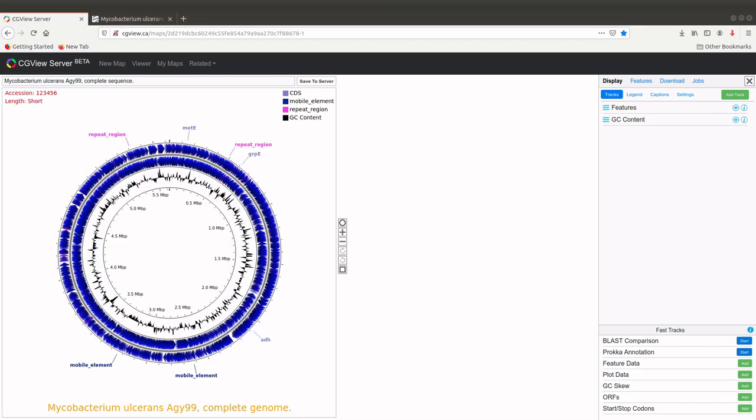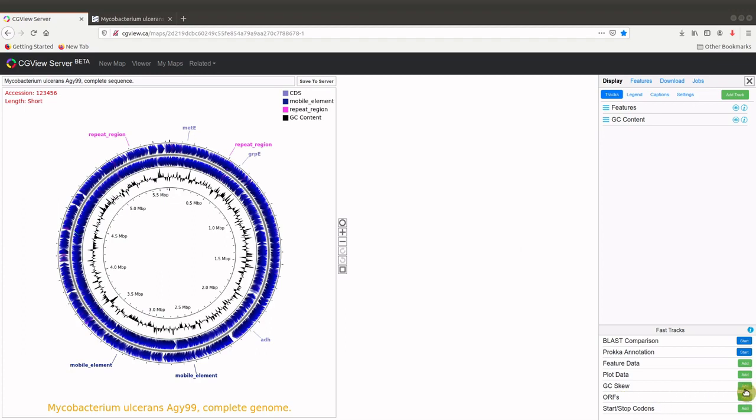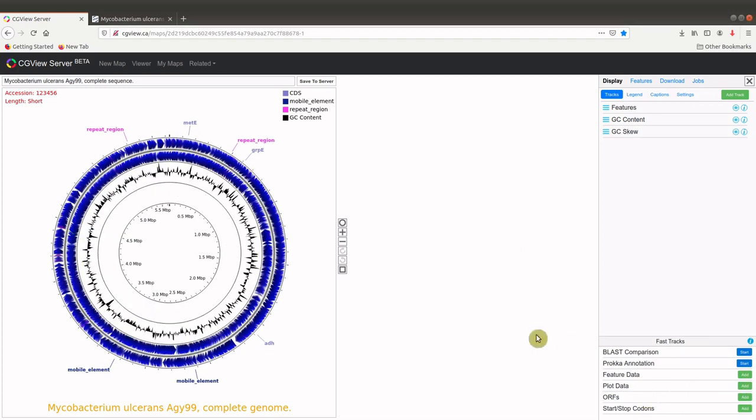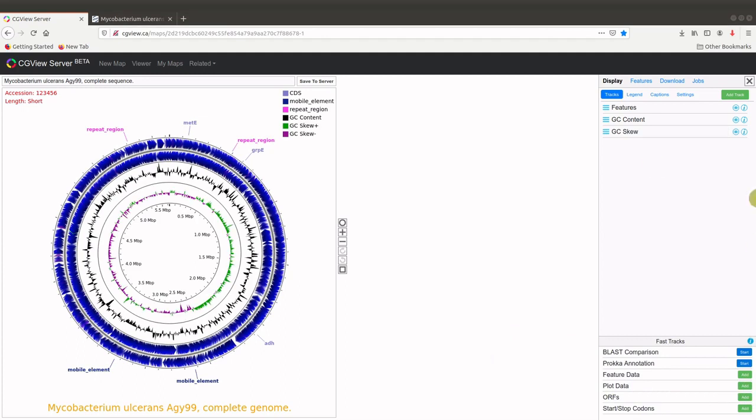So when it's complete, that is when it's at 100%, then this also appears. That's the GC contents. You can also add the GC skew. That is also complete. We have that here. So that is for the genome map.